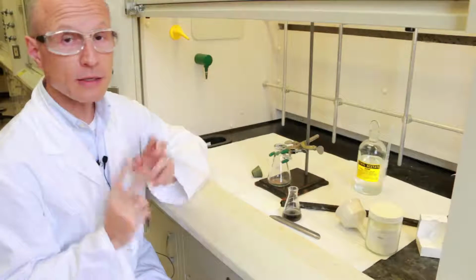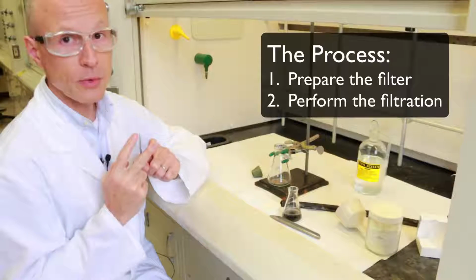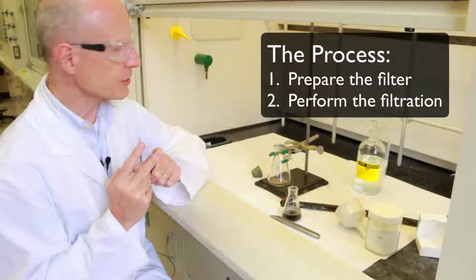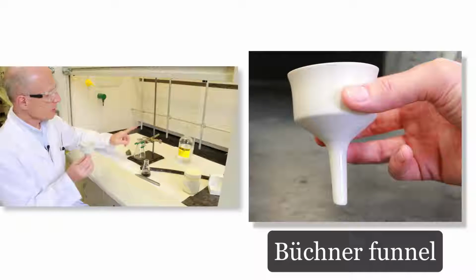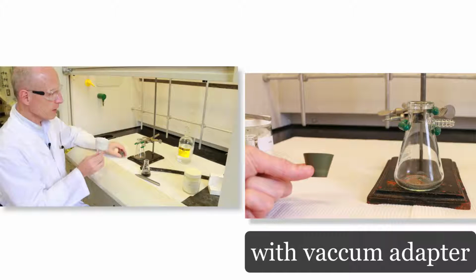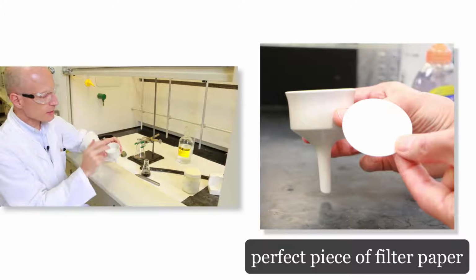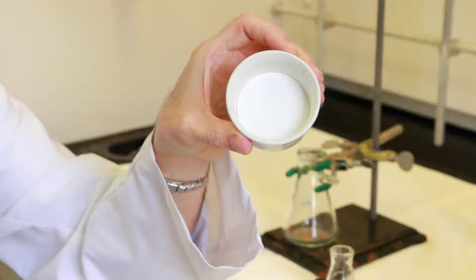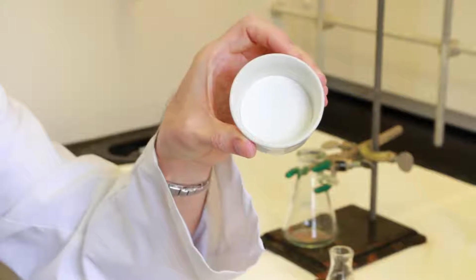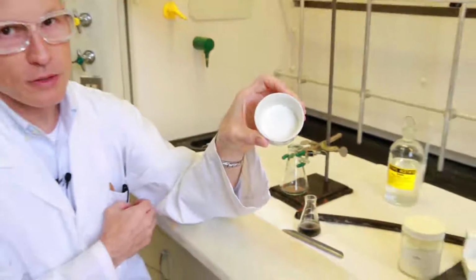Filtering through Celite is a two-step process. First, you have to prepare the filter, and then you can perform the actual filtration. So you will need a Buchner funnel, a clean filtering flask with a vacuum adapter, and a piece of filter paper that fits perfectly inside your Buchner funnel. It cannot be too small, obviously, or too big that it climbs on the walls of the funnel.